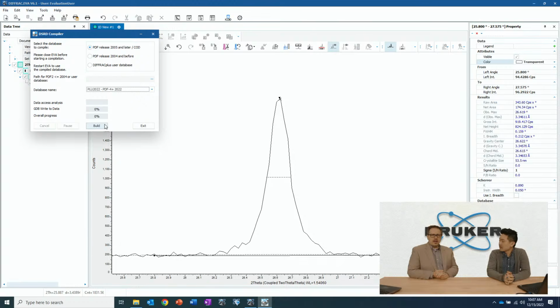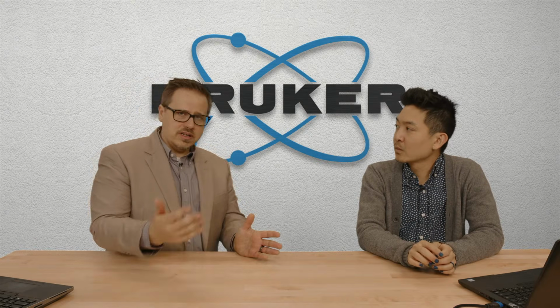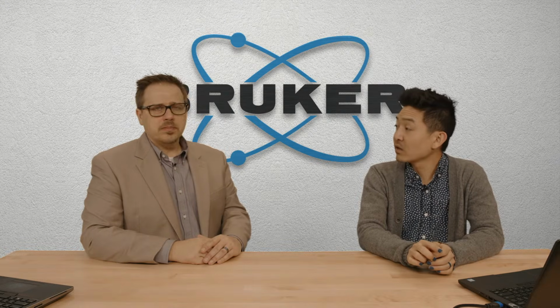The thing is, though, it does require the license, and it does actively check that that license is still valid. Generally speaking, for most users, it's a single computer installation. They have all the details about what the licenses are. PDF4s, I think, are generally one year, with yearly renewals. PDF2, I think, is currently a five-year license.